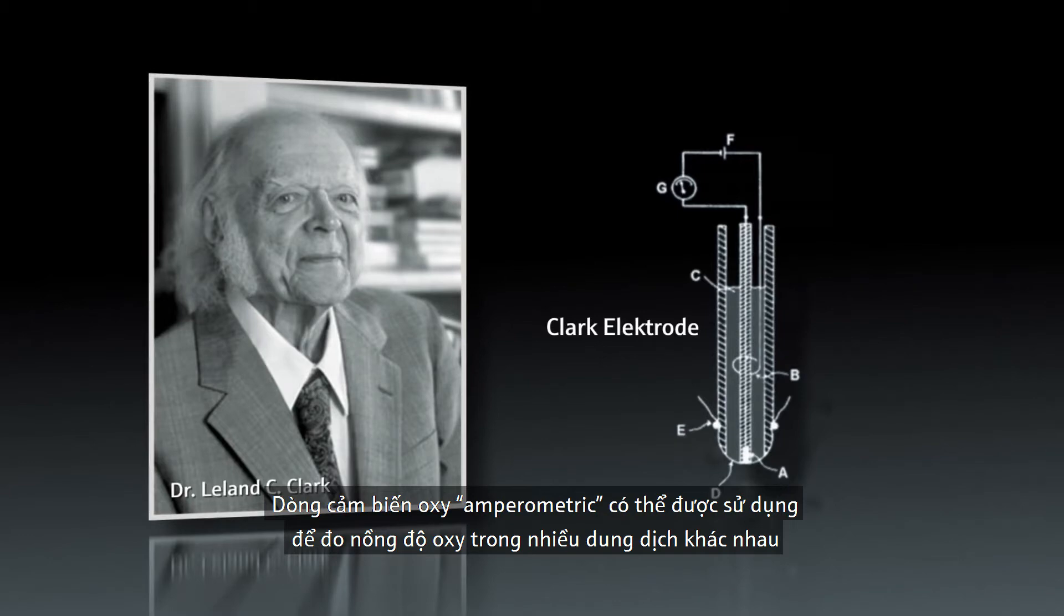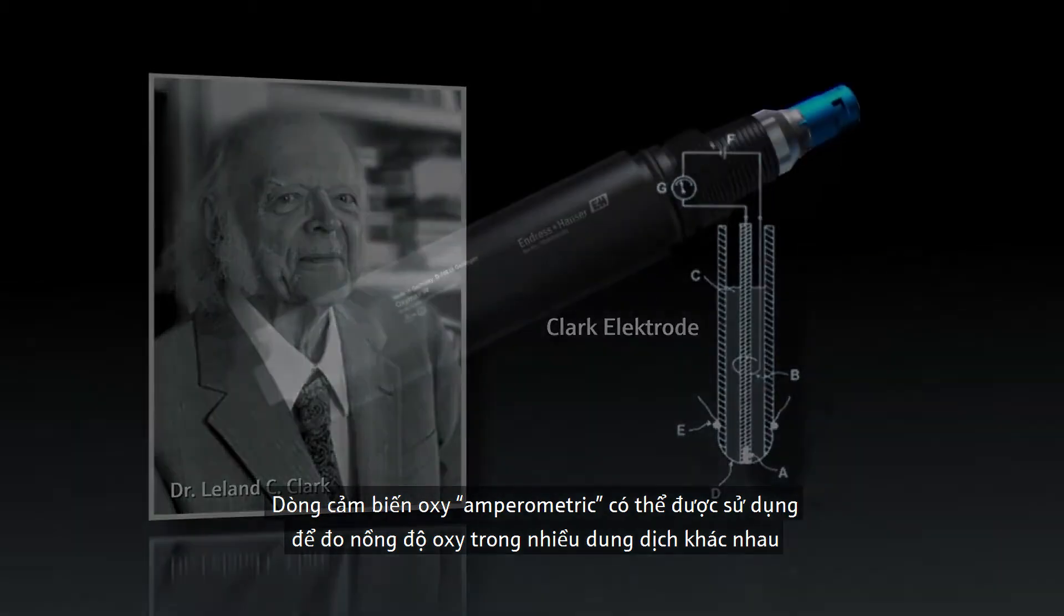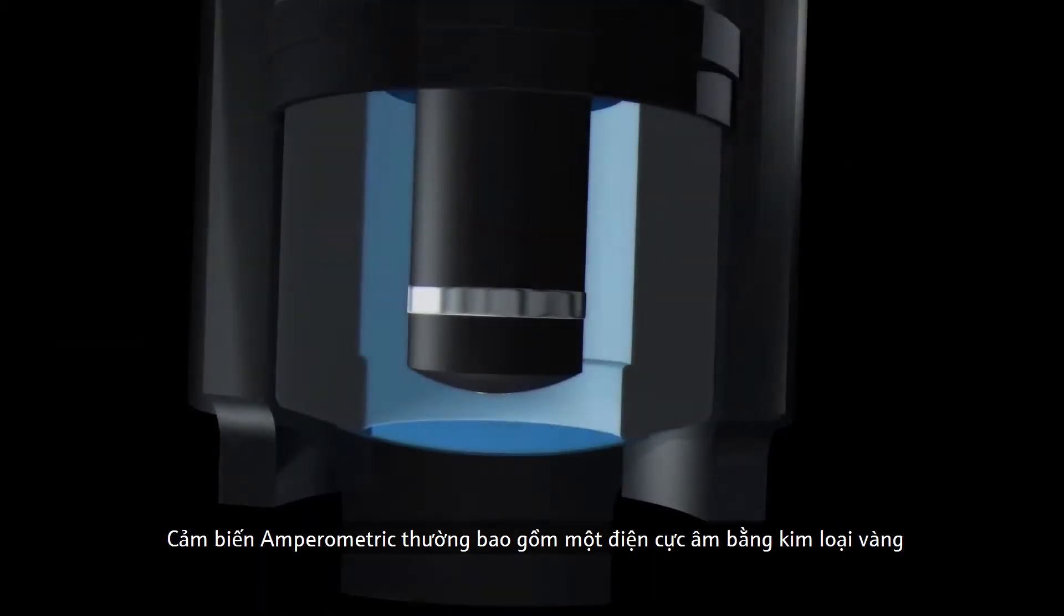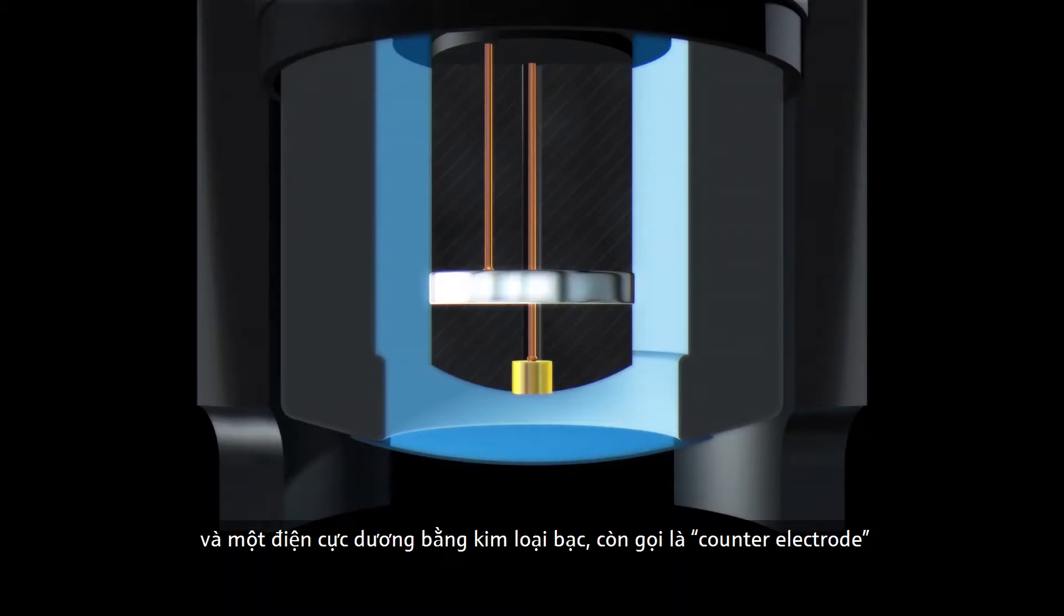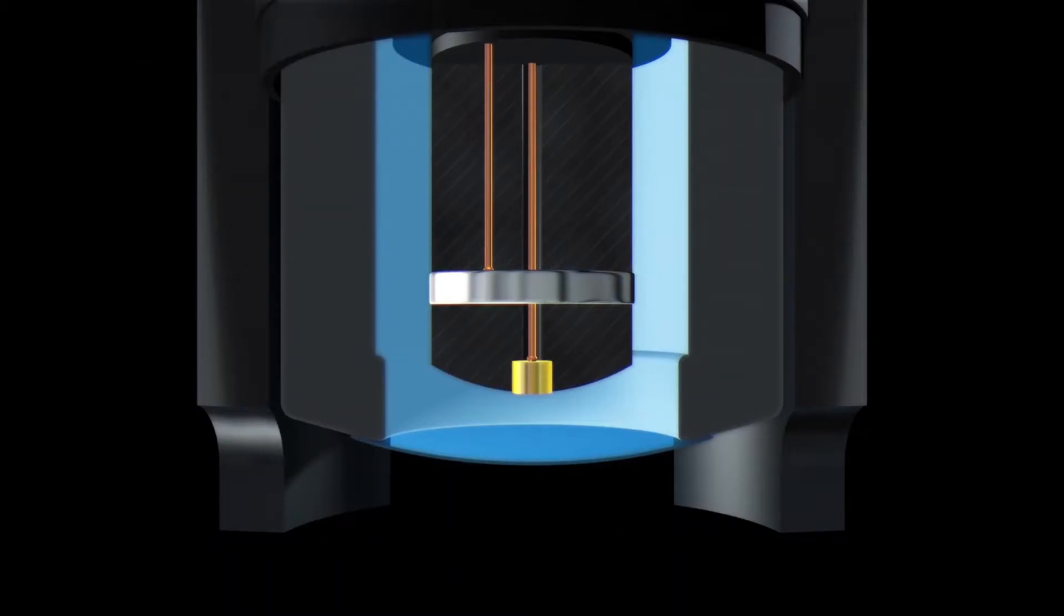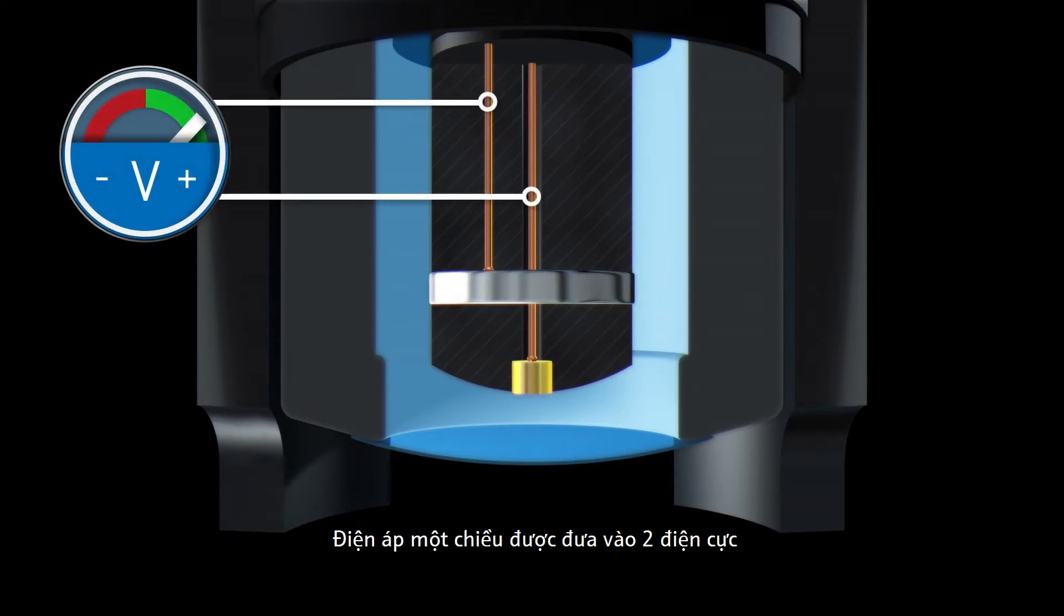An amperometric sensor usually consists of a gold cathode, also called working electrode, and a silver anode, the counter electrode. A DC voltage is applied to both electrodes.